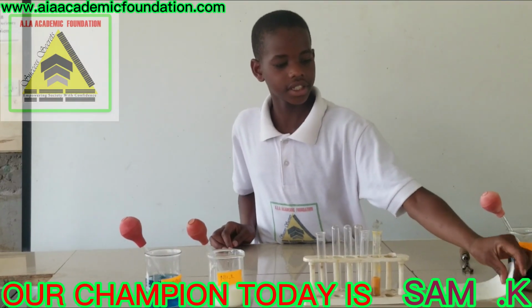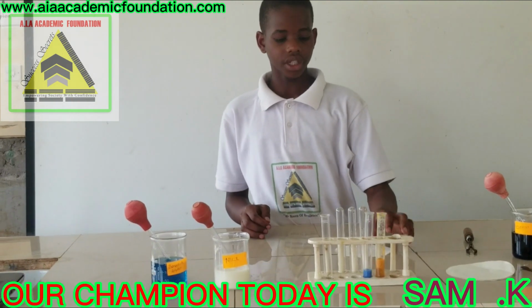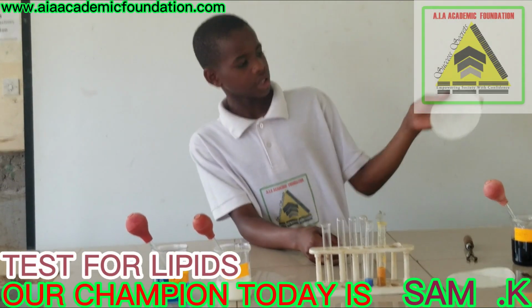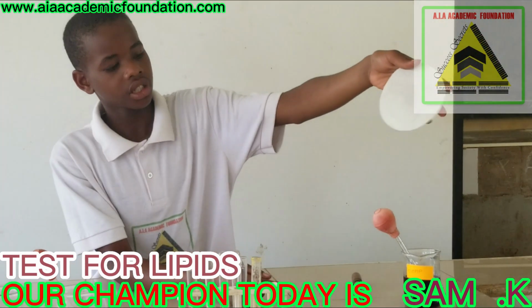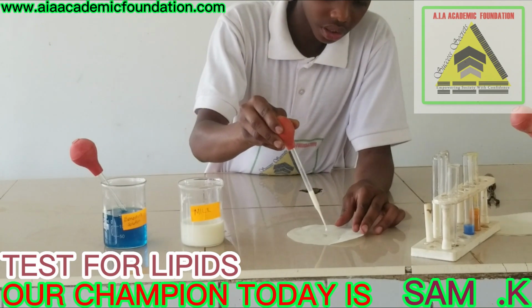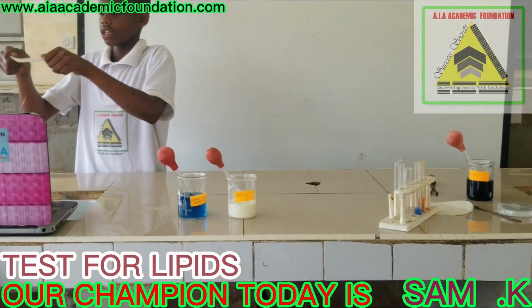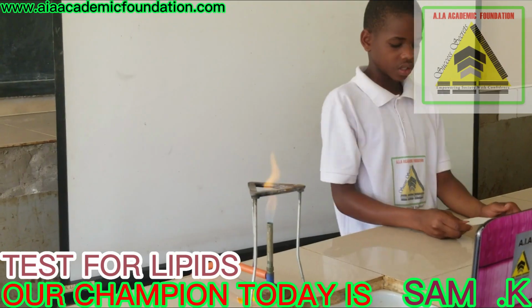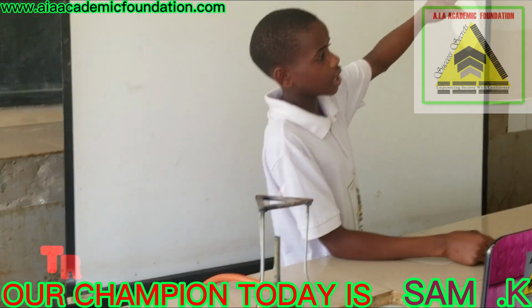For my next test, I'm going to test for lipids. And the apparatus I shall use is the filter paper, which is white in color, as you can see. To carry out this test, I shall just get about 2 drops of milk and pour it on the filter paper, and then pass it over the heat source.